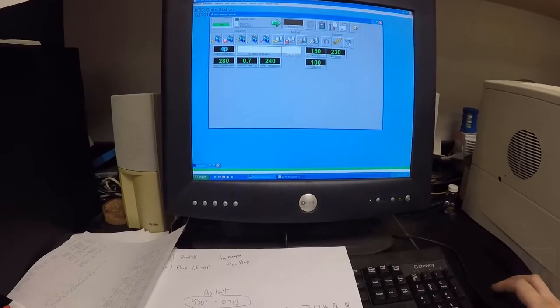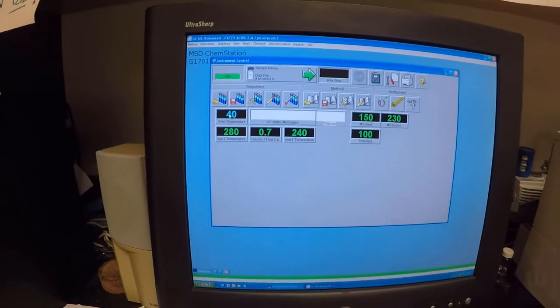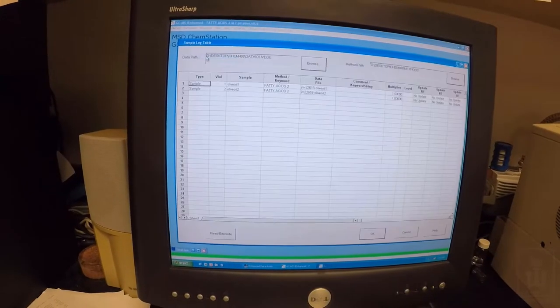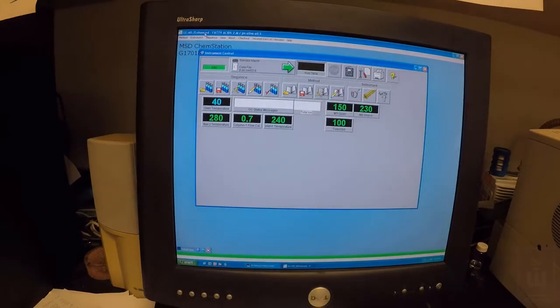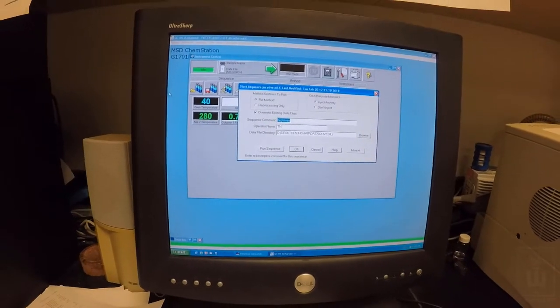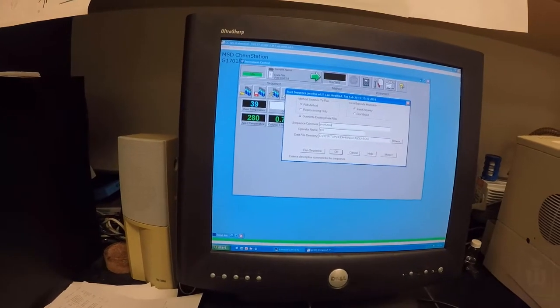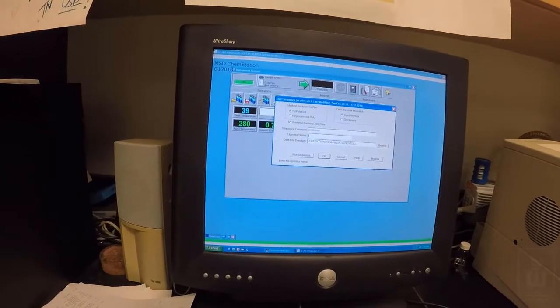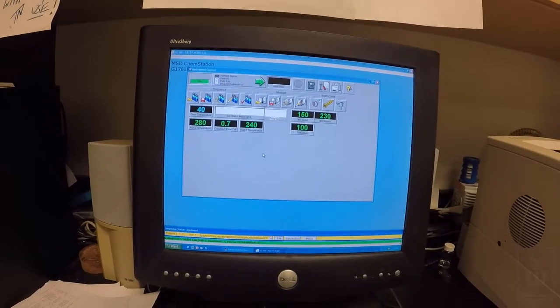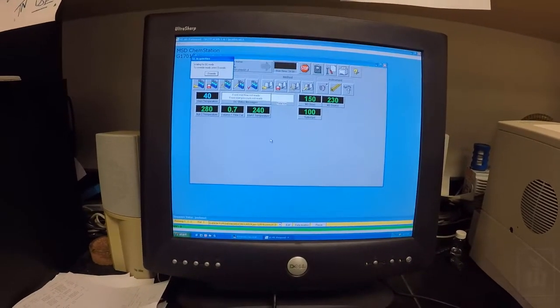All right, so we have seen that there's no GC status message anymore. Our oven temperature is where we want to start at, and this will be different for every method that we do. As long as there's no status message here and you have your sequence all edited and ready to go, and our data files are in the right place, we're just going to go here and go to run sequence. Let's do a comment on here. I'm just going to say JM olive oil. Use your initials, you don't really have to. Make sure the data is still going to the right place, and then hit run sequence. That's going to send the instructions to the GC-MS to begin the analysis.